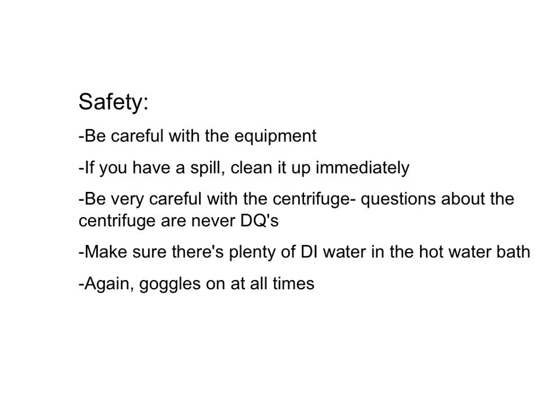Last but not least, guys, goggles at all times. We're dealing with a lot of chemicals. I've had chemicals squirt into students' faces, and the only reason it didn't get in their eyes was because of the goggles. So there's a reason we make you wear them. Please, please, please, if you are in the lab or near the lab, you need to have your goggles on at all times.